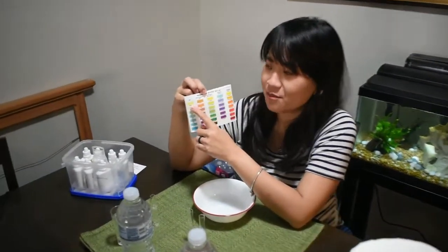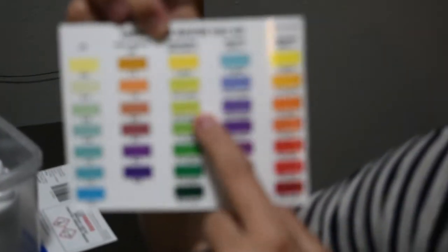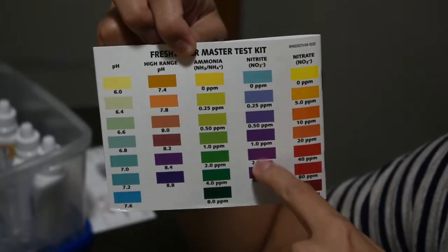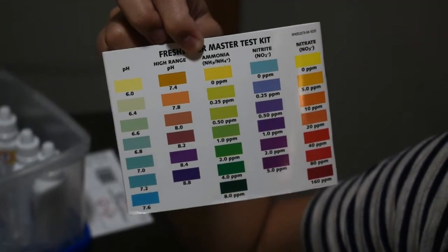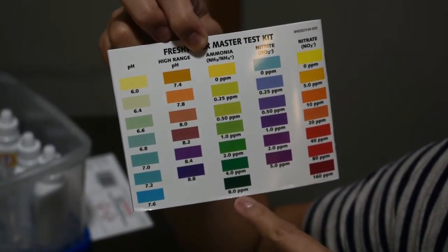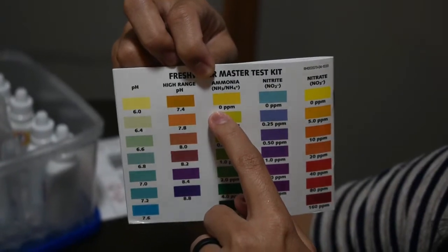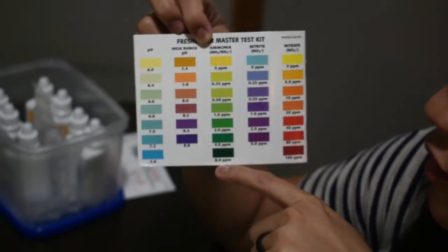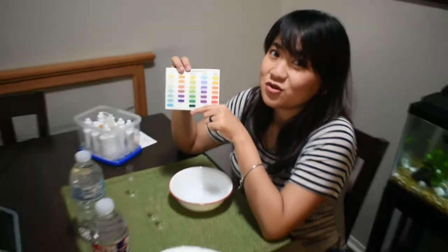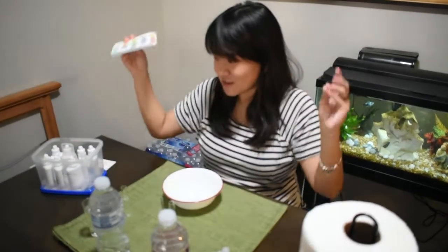It gives you a lot of things in here. You can test the pH. You can see from all of this high range ammonia. This is the one we will test today, the ammonia, and nitrite and nitrate. Today I'm just going to do the ammonia because it's important for me. The really good ammonia level you want is 0 ppm. The more the color goes down to the green one, it's really dangerous, really poisonous, like drinking your own pee. But you know, let's start.